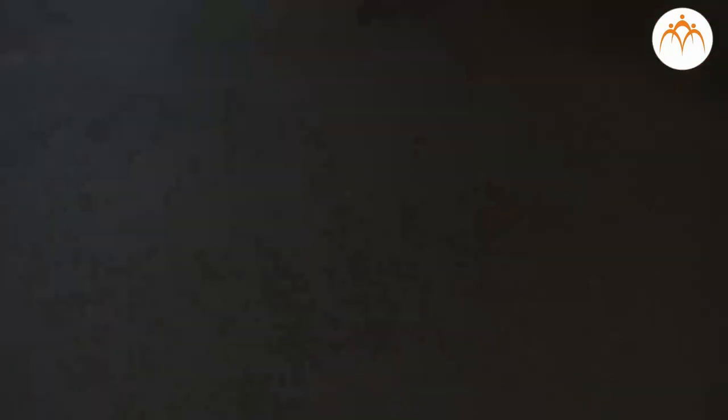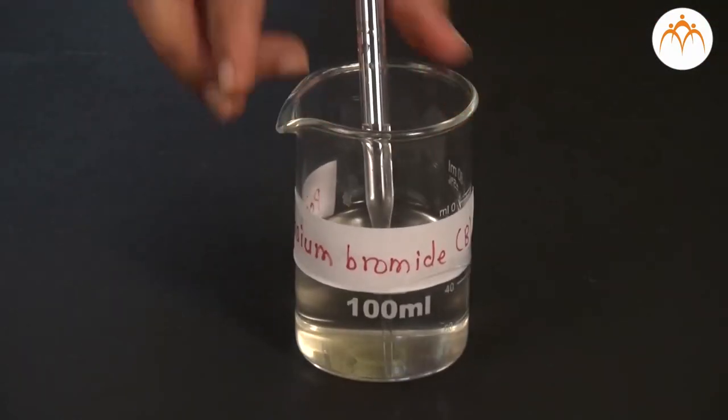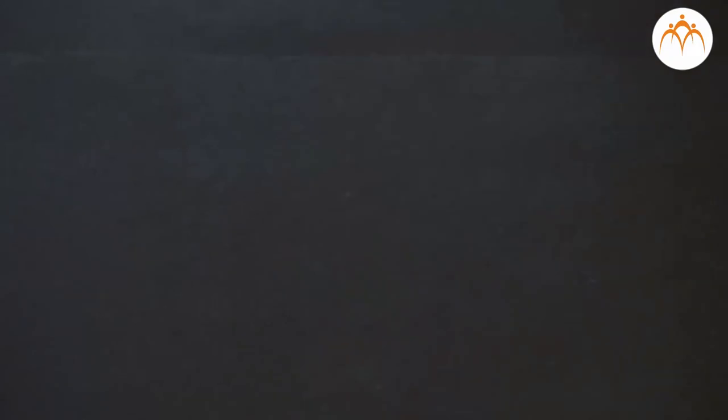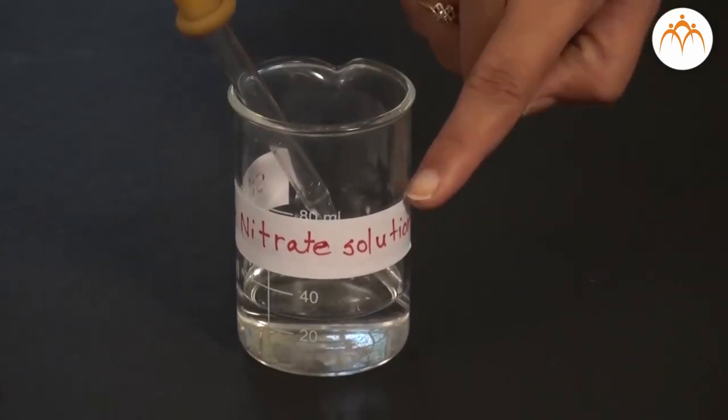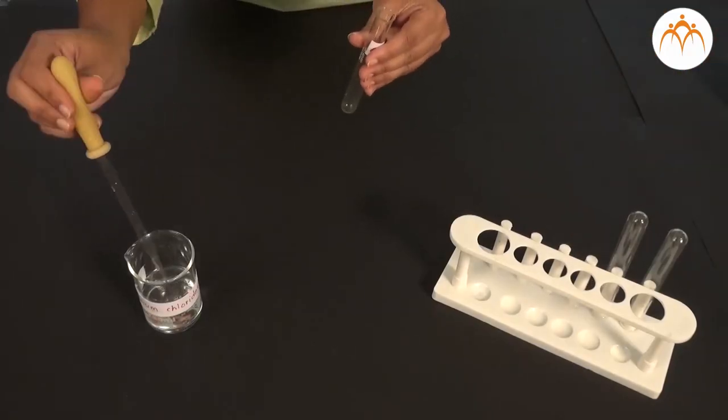Procedure: We keep solutions of potassium chloride, potassium bromide and potassium iodide in three test tubes and label them as A, B and C. Now we want to find out what they really contain.